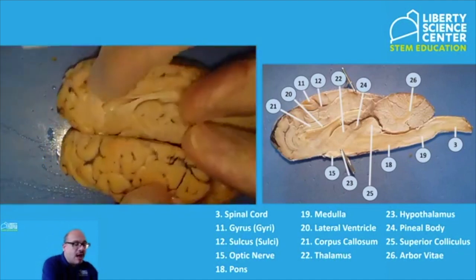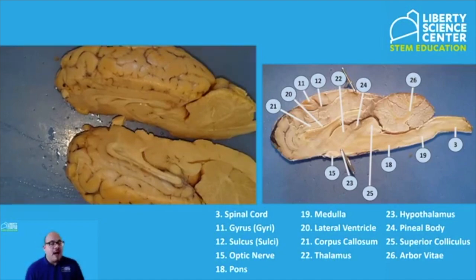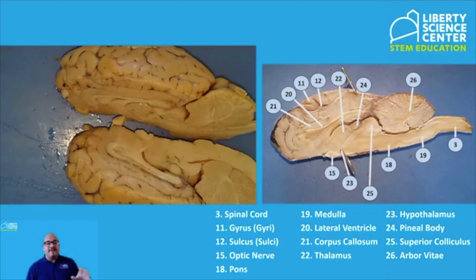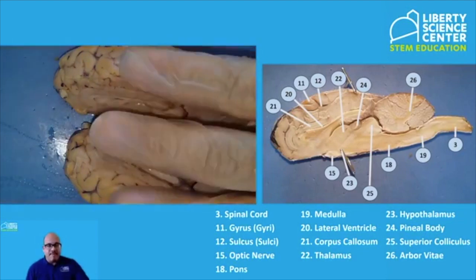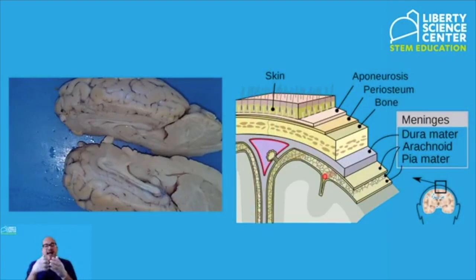So we pretty much went through a lot of anatomy through this dissection. We can delve deeper. There's a whole lot of information that we can look at in terms of the brain. These are just a good list of some of those parts that we can see through this type of specimen. Obviously, I didn't go through all the nerves. There are 12 nerves found along the length of the brain that are called the cranial nerves. You can see some of those little nubs, but we can't see them well without the usage of a microscope. I also previewed a little bit of the meninges. The meninges right here are the extra protective layers that envelop the brain and the spinal cord. There are 3 layers.